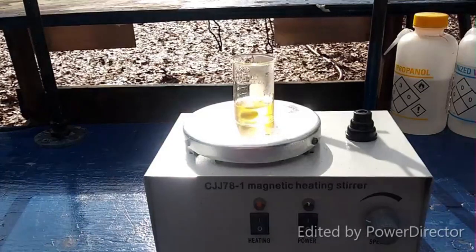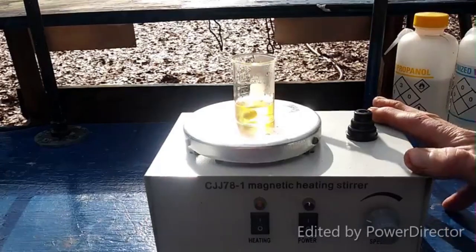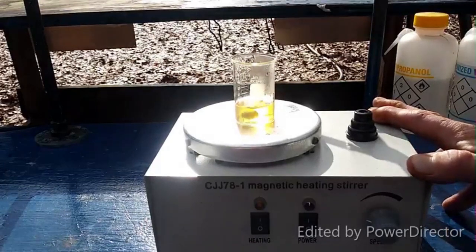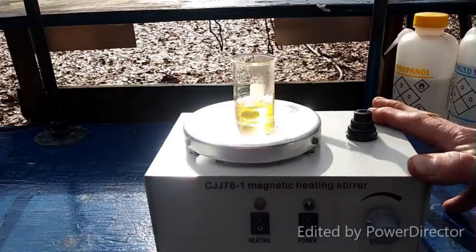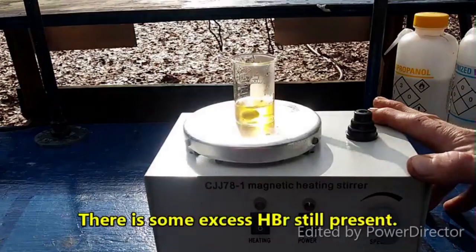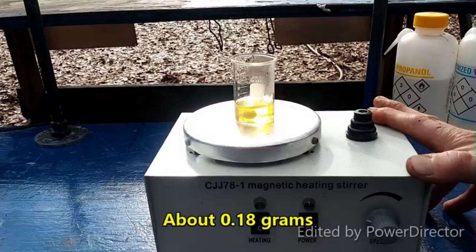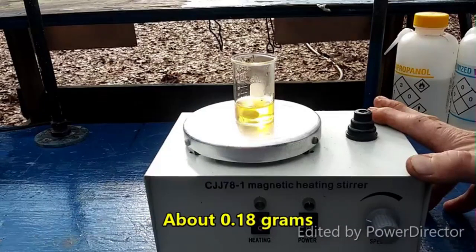I'm doing a follow-up experiment here where I've taken 0.54 grams of thorium hydroxide and I've neutralized it in concentrated hydrobromic acid. I have added 3 molar equivalents of ammonium bromide and I am evaporating it down now over low heat.